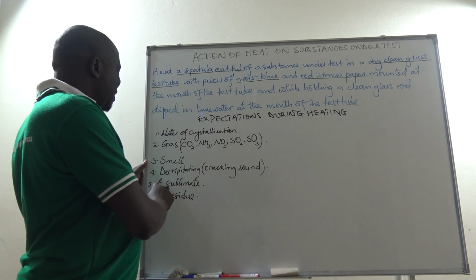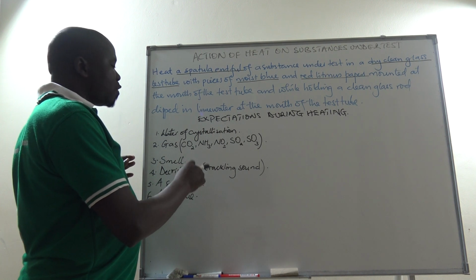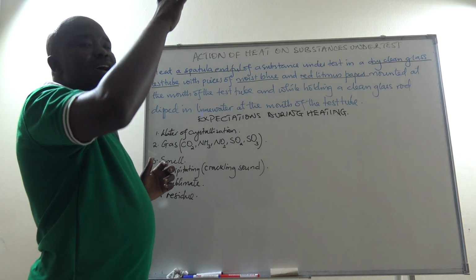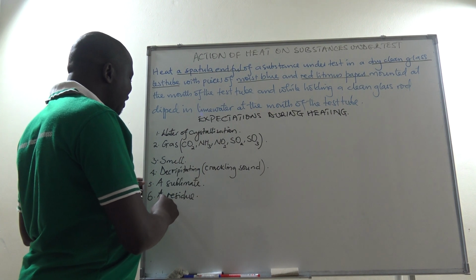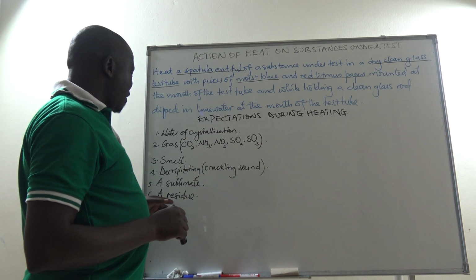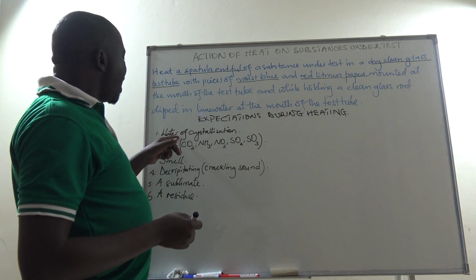You expect to get a sublimate during heating. A sublimate is what forms when a solid is heated and changes into a gas and later on cools rapidly and changes back to a solid. That one becomes what we call a sublimate. Then the solid that remains after heating, which is called a residue, is also expected. So we need to take note of any one of these.